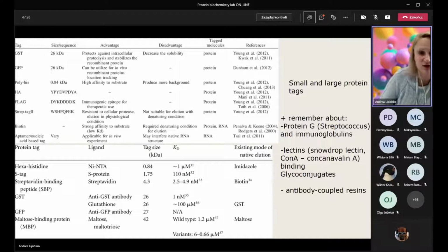So the signaling sequence of your protein will come first, or you can use signaling sequences from some other proteins, like for example from immunoglobulins. Then the tag, and then your protein. And you have to make sure, by using predictions, so programs which recognize signaling sequences, whether when you add your tag after the signaling sequence, it's still recognized by the signaling peptidase or not. So you cannot interfere with that. Otherwise, you will get a wrong localization of your protein. So generally, that's it. So any other questions as regards tagging?